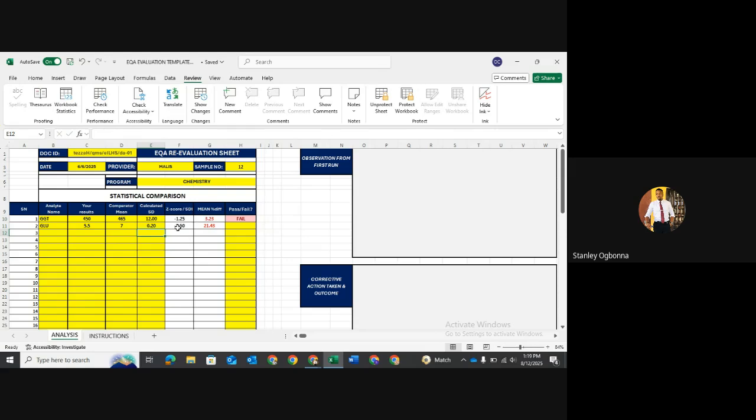So you can see that it's also on the negative. Based on your deduction here, you know whether it passed or failed. Like I said, you should know how to interpret it by now. And based on this, you can see whether it passed or failed. It's the same thing. The Z-score calculator here calculates for both positive and negative. Another thing you observe is when you try to impute data, let's say we're looking at potassium now, or urea, for instance, or let me go for amino acid.